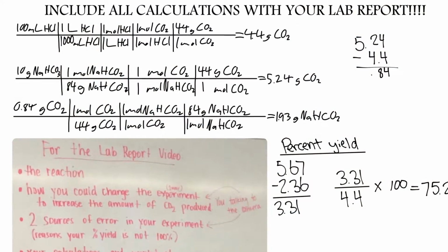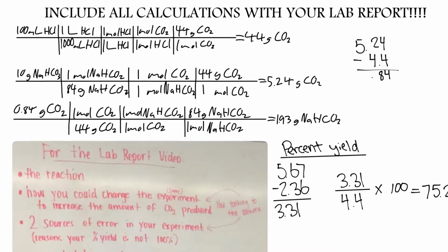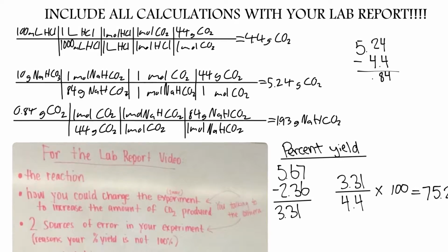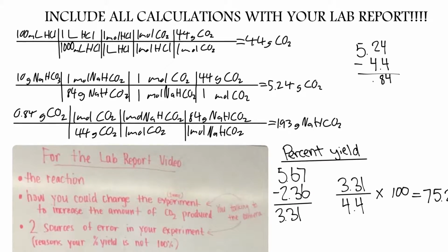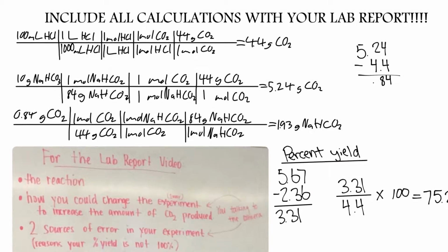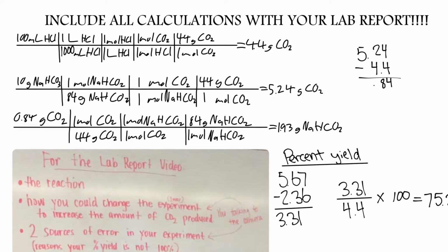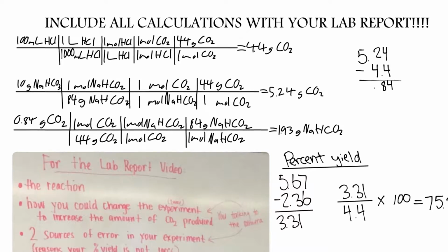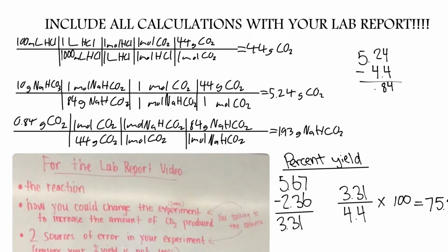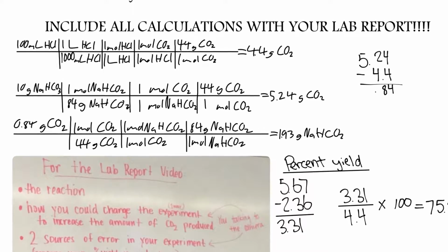In order to find out which reactant was limiting and which was excess, we used stoichiometry. First, we calculated how much carbon dioxide could be made out of each reactant by multiplying the proper conversion factors together. First, we multiplied the amount of hydrochloric acid we used in the experiment by the ratios from the acid's volume to its moles to the moles of the carbon dioxide to the grams of carbon dioxide to find out how much carbon dioxide the hydrochloric acid could make.